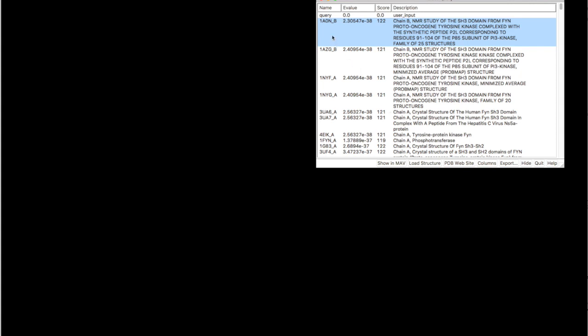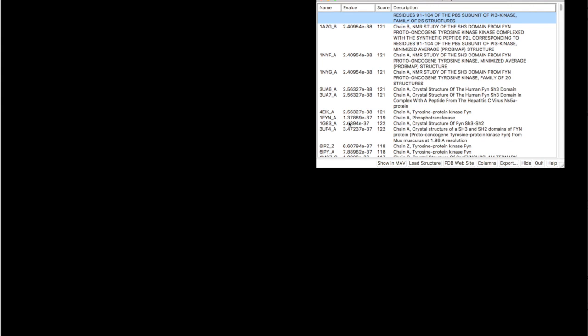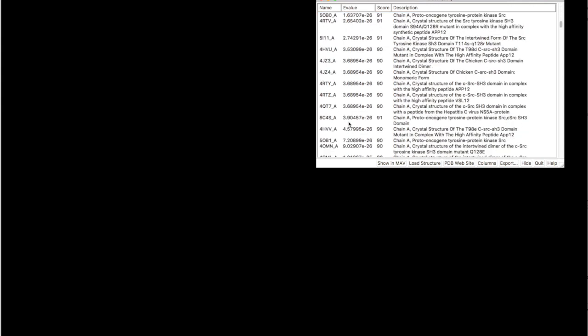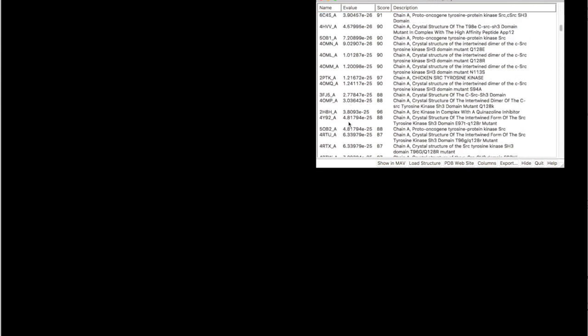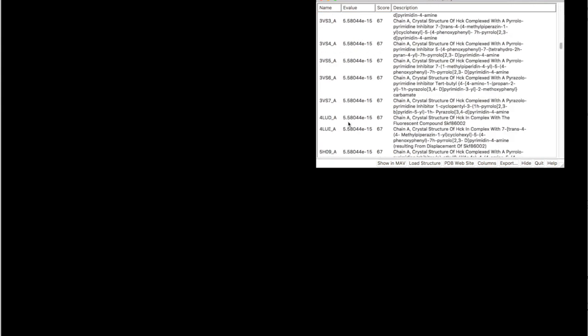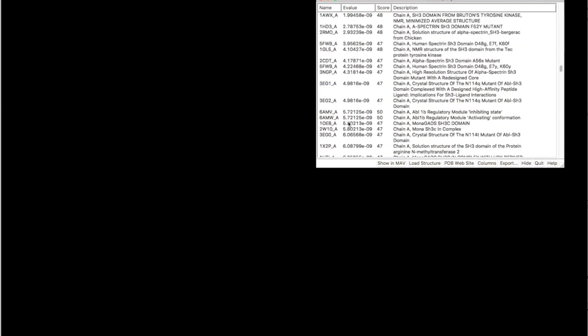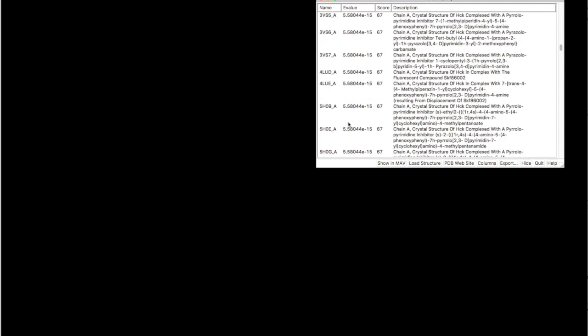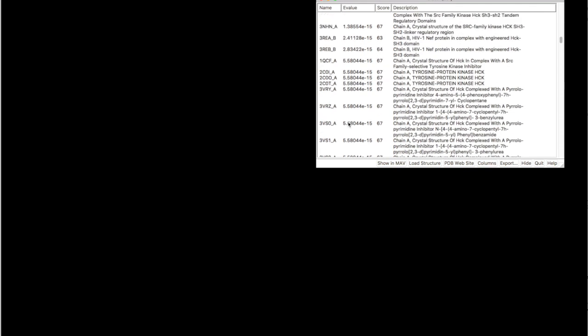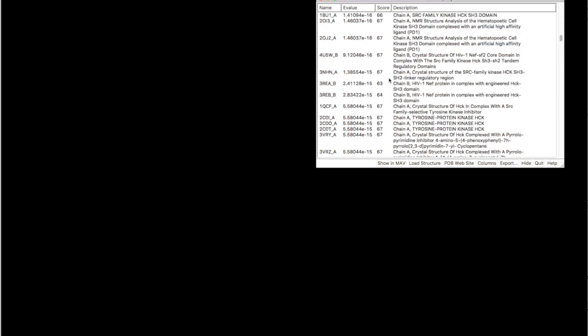You can select either one template or many templates here. I will select a template that is not that similar.